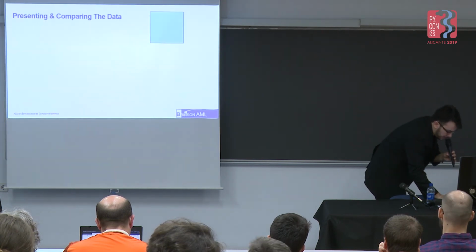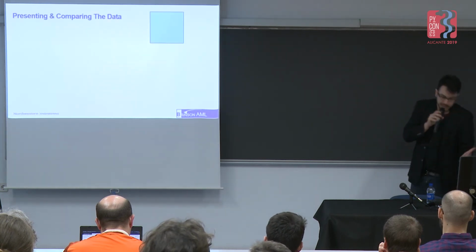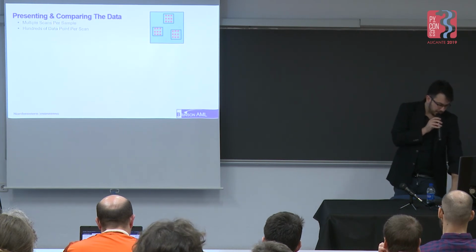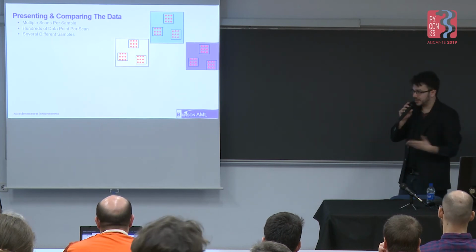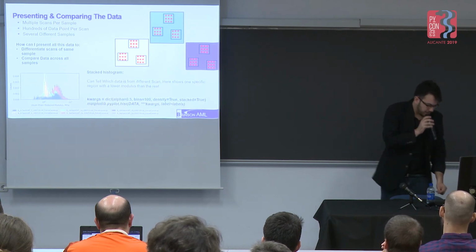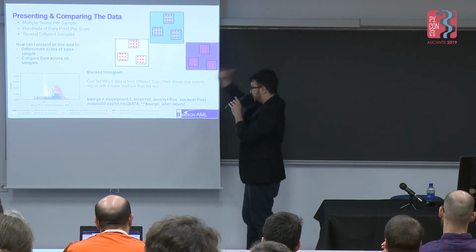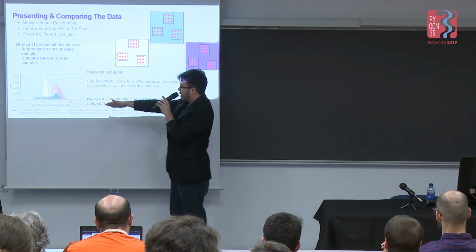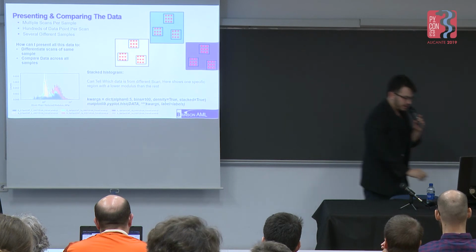Yeah. So now that I have all this data for a single scan, it gets more complex when I have a sample with multiple scans, and each scan has multiple data points, and there are several different samples. So how can I look at all this data intuitively and get some information about that? One of the ways is to do a stacked histogram, where each scan in a single image is a different color, so I can see, okay, in this one I have 2 different peaks, but one peak is only from one scan, and all the rest are slightly higher in that response.